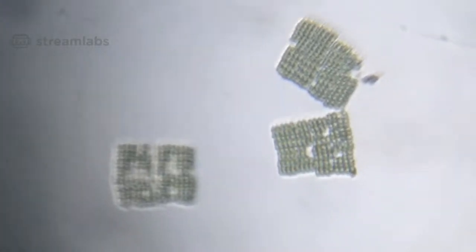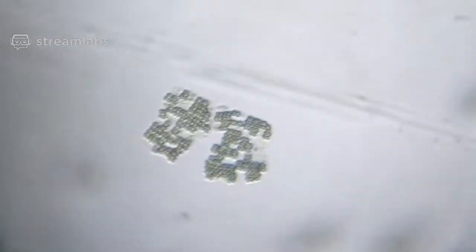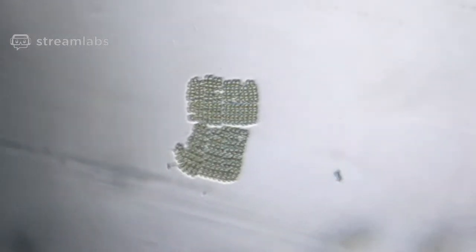The funny thing is, there are many problems in biology that haven't been studied because professional biologists have their own favorite systems. They have genetics in certain systems, and you cannot study everything. But what if a million Foldscopers with some pre-planned idea look at some things, maybe study Merismopodia, who knows, right? So you can have many more hands just by increasing the number of people who have access to microscopy.